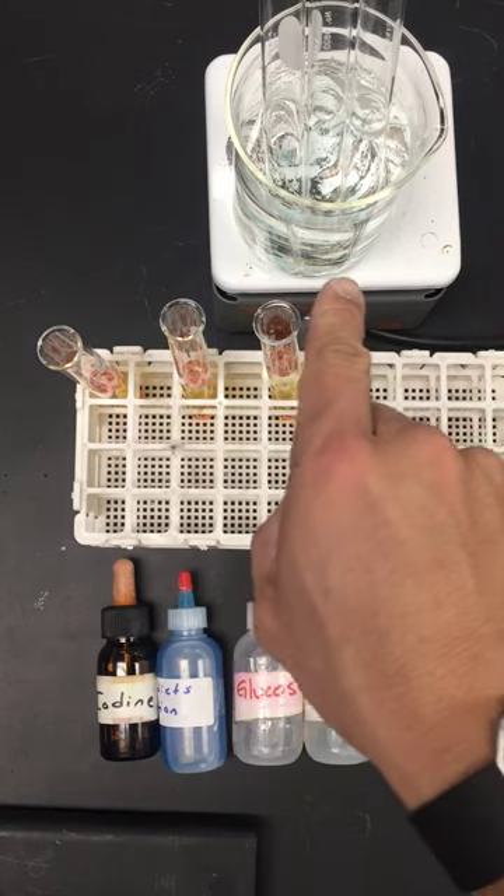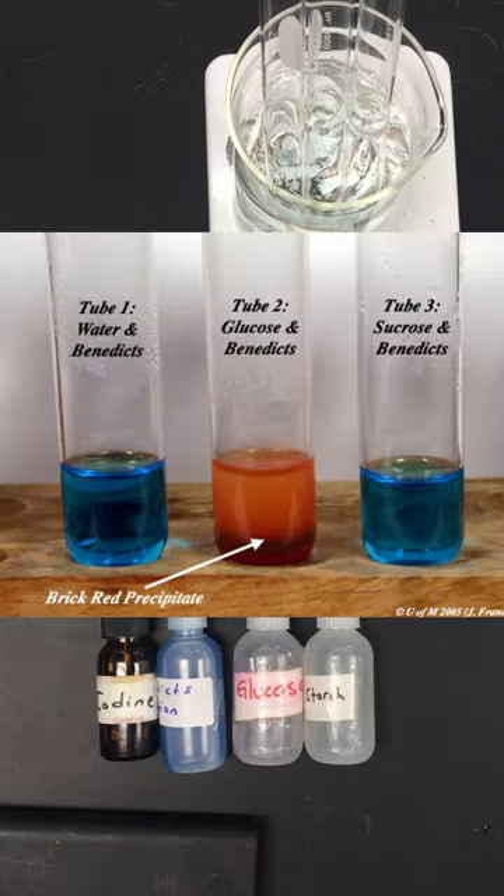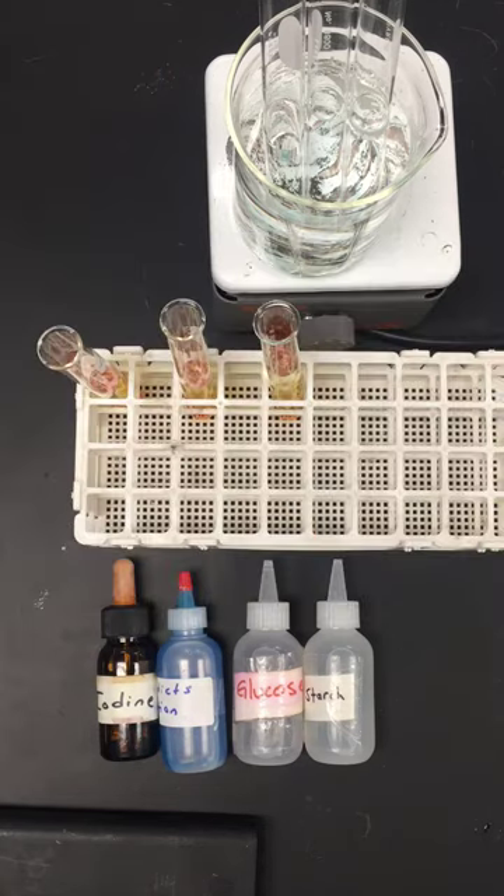Look for any color change in the test tubes. A positive test for glucose will show an orange or red color change. The other test tubes will stay light blue or whatever color they were going into the hot water bath. Once done, record your results in the table two portion of your lab packet under chemical test results, and enter the colors that you see. That's all for the chemical testing portion of the lab.